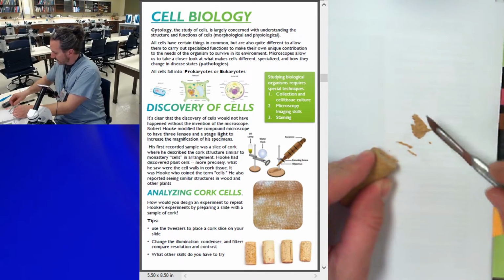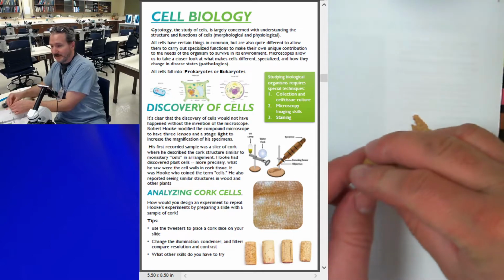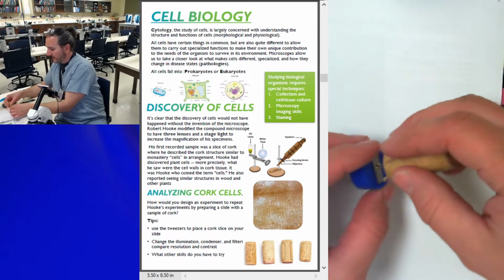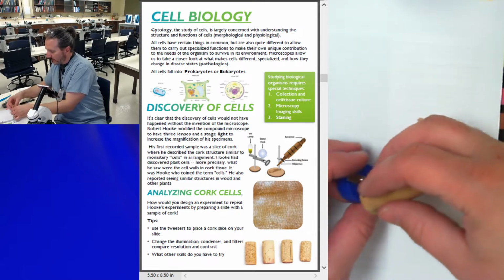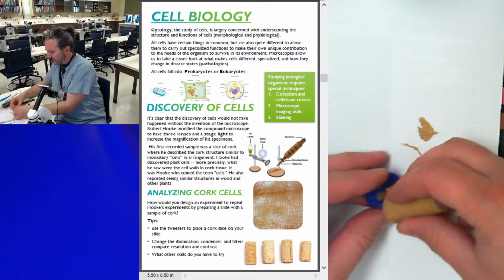So, I'll show you how it's okay to be a little bit messy. Take some of these shavings. I flip my blade over, and I'm just going to run it right along the edge. Oops.